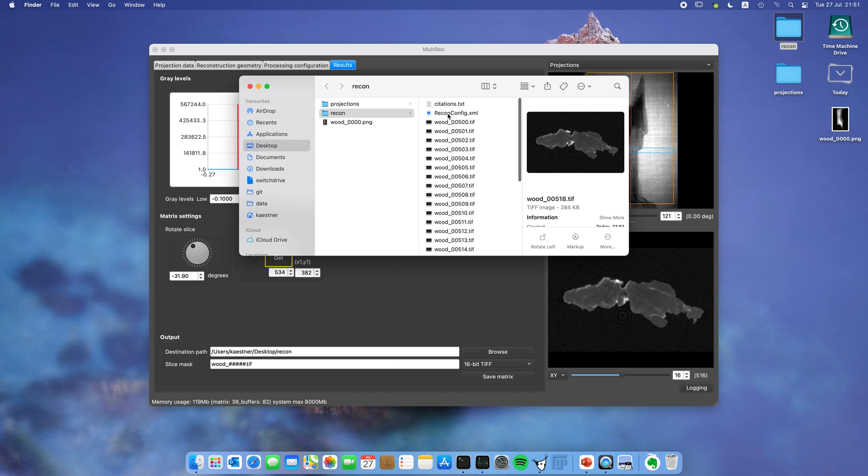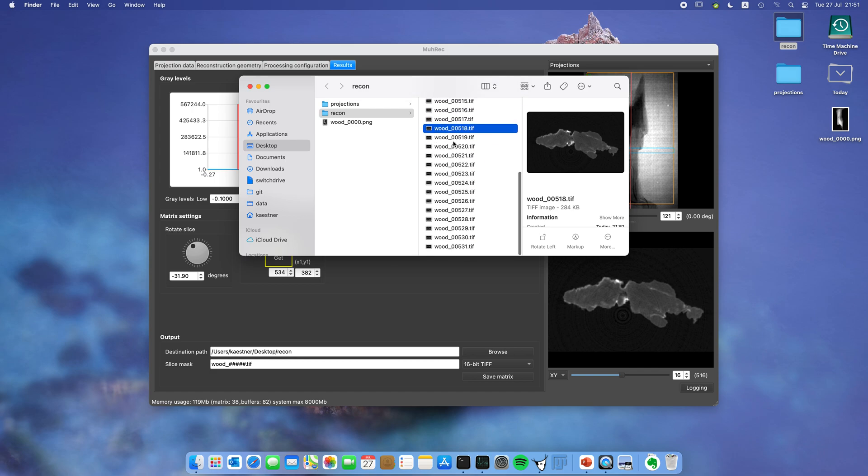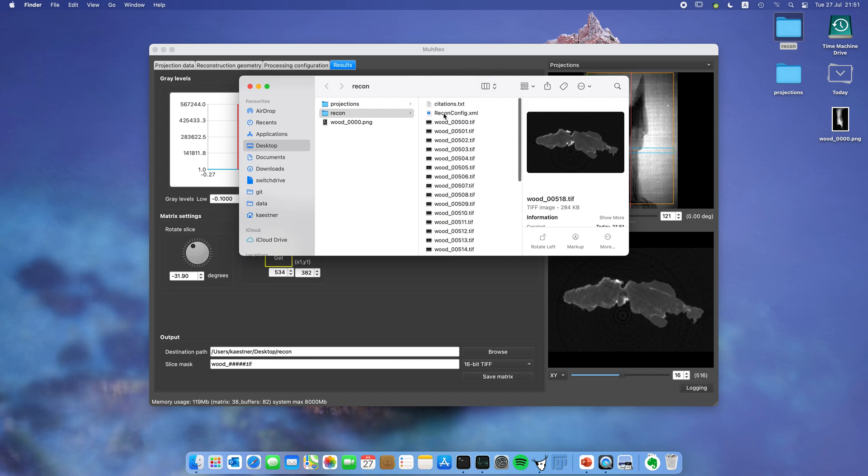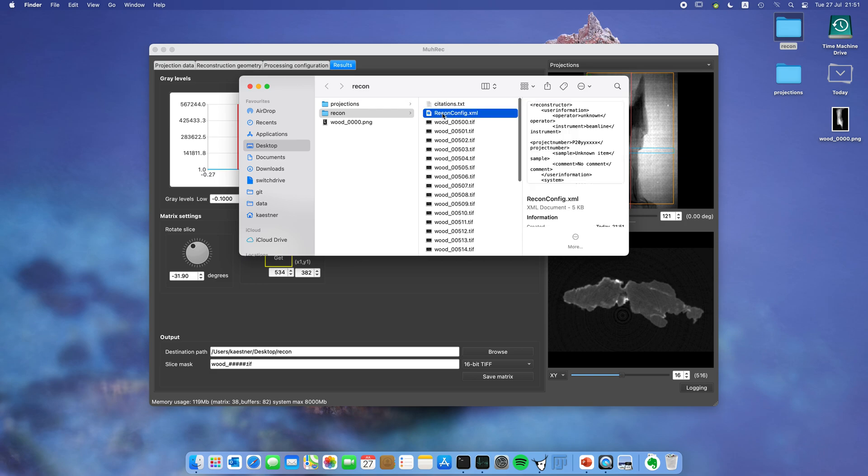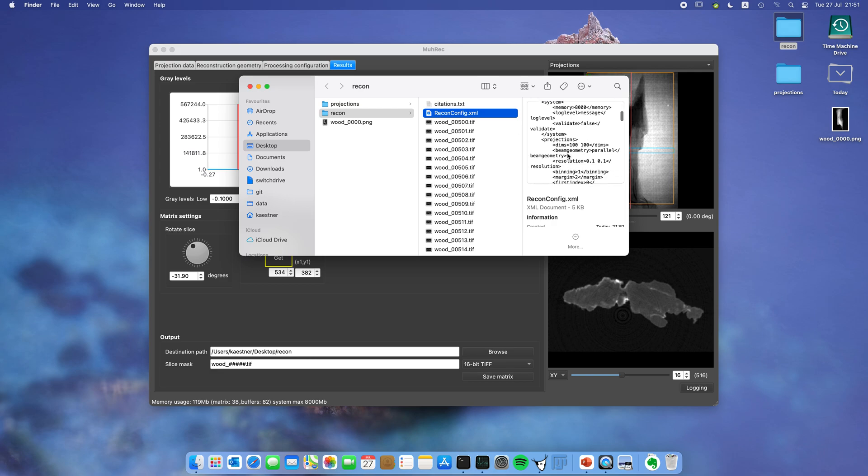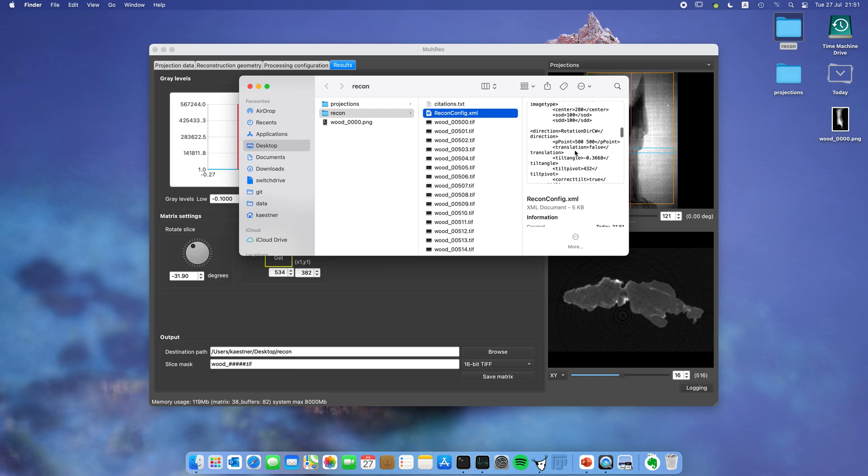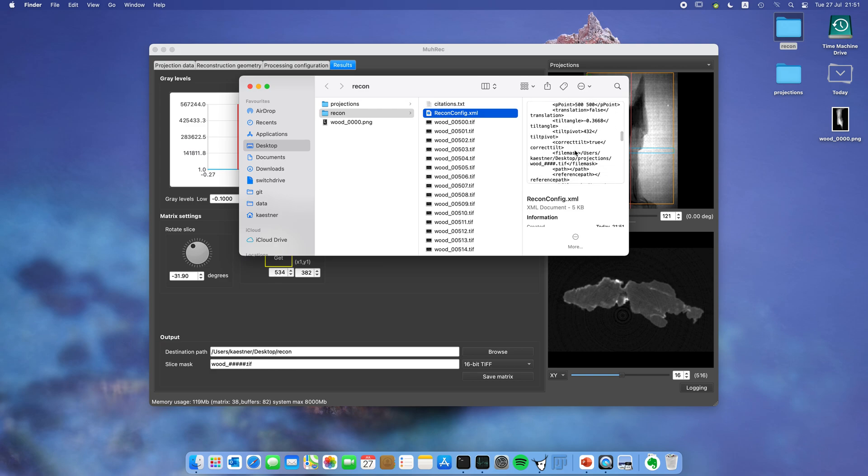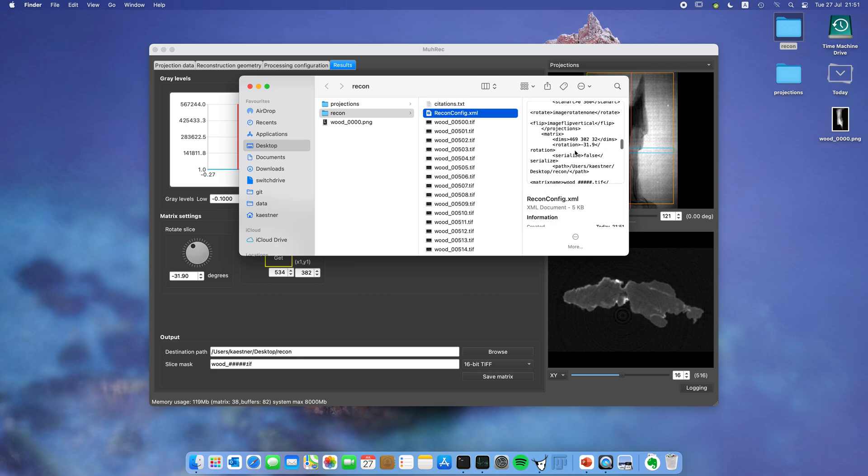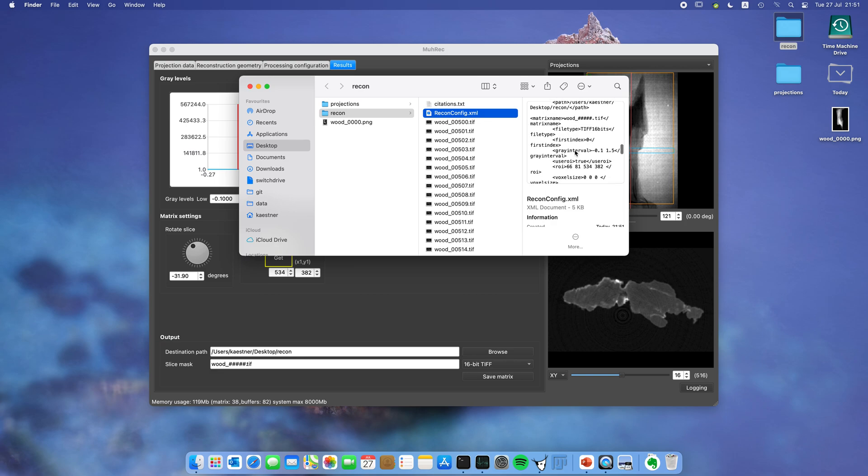What you also get in the same folder is a Recon config. This file describes exactly what the reconstructor has done with your data. It tells you about dimensions of the image, pixel sizes, which center of rotation you used, which scan arc, also which reconstruction algorithms you've been using. It's not easily human readable, but still all information is there. You can actually load this file to redo your reconstruction next time.